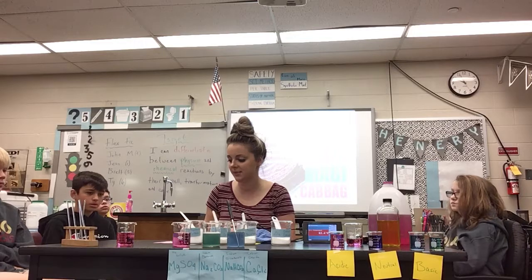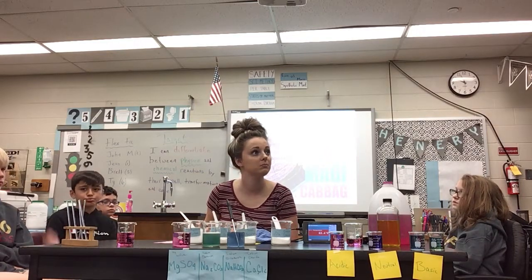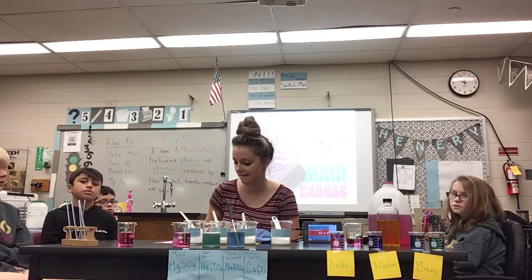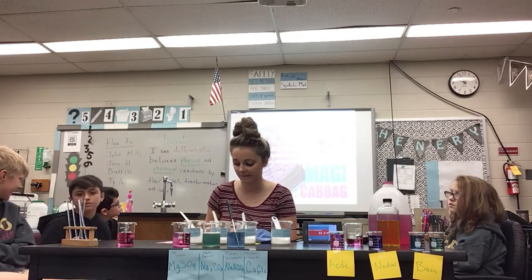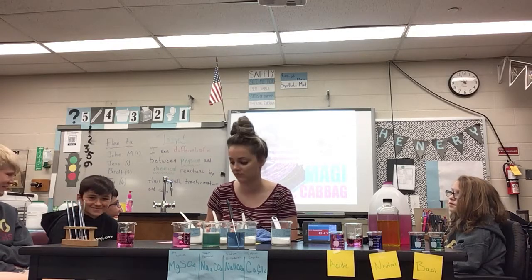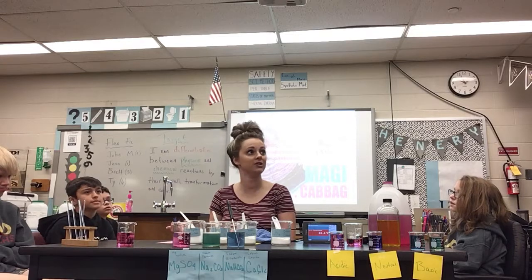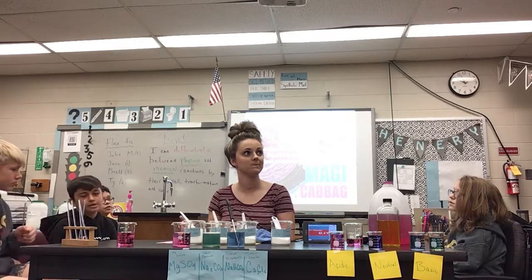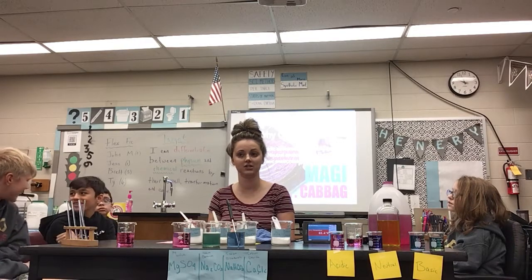No. Evidence of chemical change? Yes. Okay, color? Dark blue. Blue, so what is it? I think basic. Basic. All right, what are we hitting? 63.4. So if we started at 70, about how much of a drop? Over 10. 6.6. About 6 degrees.